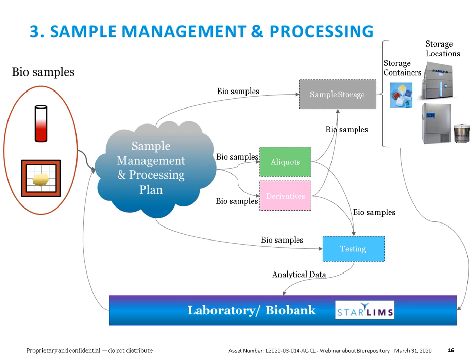Samples may need to be perhaps aliquoted, or perhaps we need to create derivatives for these samples. And when it comes to aliquots, for example, it's not just enough saying, okay, we are going to just need, for example, this many aliquots. We need to indicate the volume of the aliquots, the container where these aliquots are going to go to, and so it's all of this information that needs to be defined.